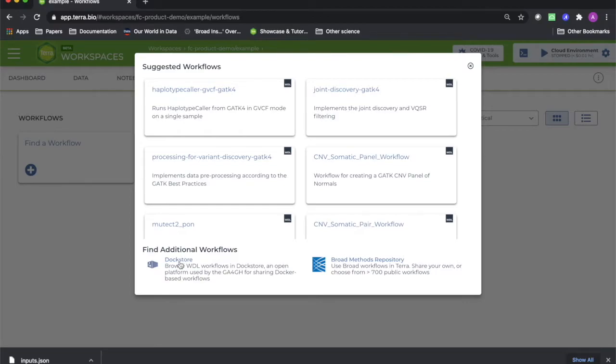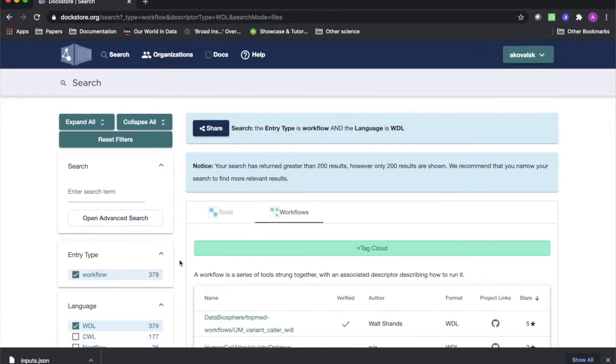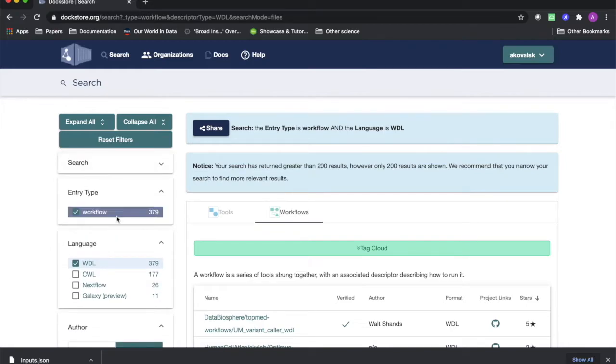Click on the Doc Store link to open this webpage, from which you can search for a variety of tools using the text search and the list of filters on the left.